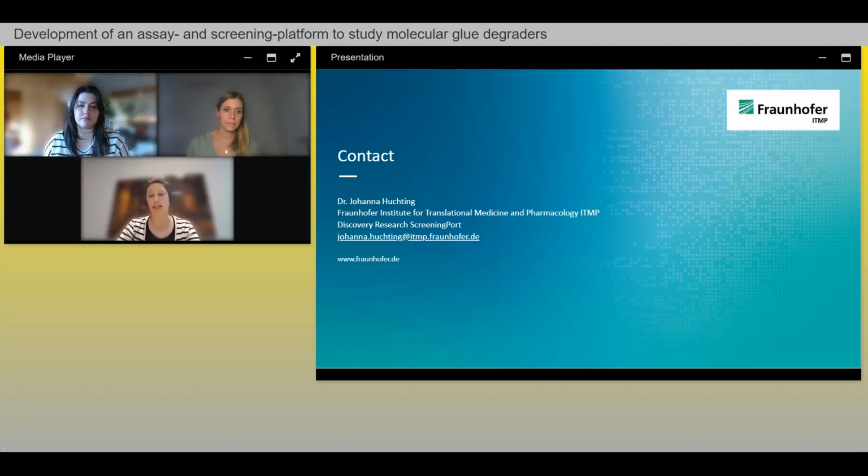So if we look then at a 24-hour overnight compound incubation, we do find more false positives. And those are compounds that really just inhibit protein synthesis. So your typical protein synthesis inhibitors, you would find PI3K mTOR inhibitors, you would find topoisomerase inhibitors. So compounds that would also show up very early with cytotoxic signals, I would say.